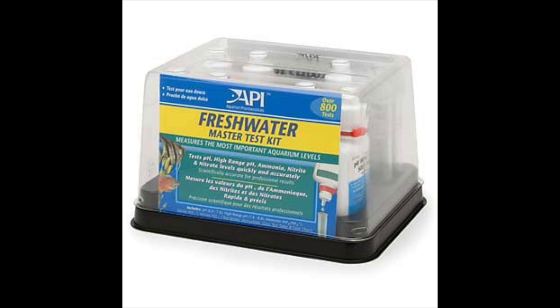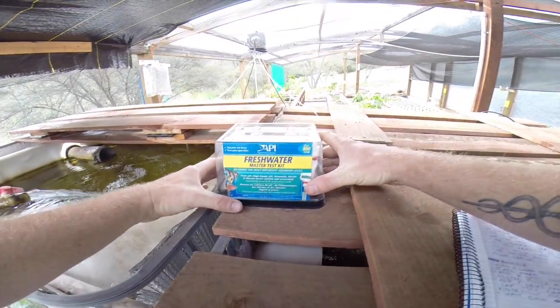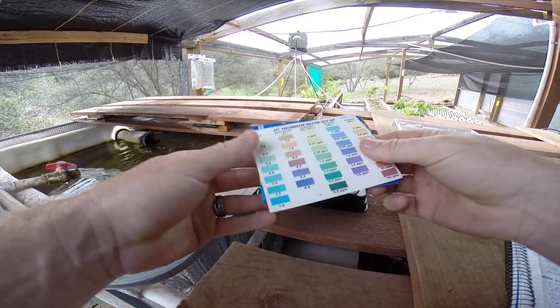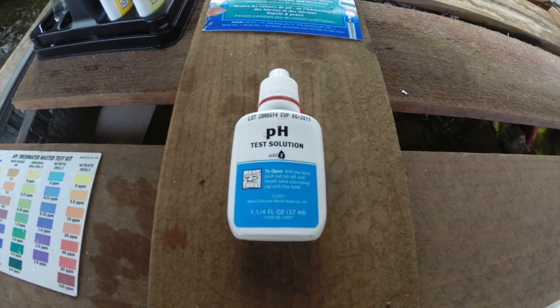In this video I'm going to explain how to use your API freshwater test kit properly. It's super important to follow the directions perfectly or you're going to get the wrong reading. So let's take a look at what actually comes inside your test kit.